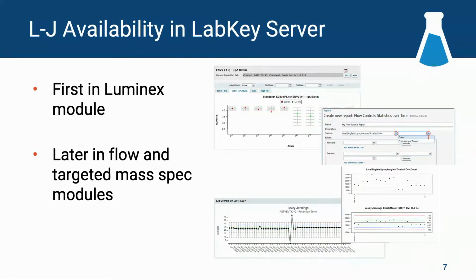We worked with a lab that essentially was adapting a workflow that they had already been following for a long time. They had a lot of historical data where they were monitoring the normal ranges for their controls that were really part of every plate. They had a handful of control wells, and they were monitoring those to make sure they were in the expected range. And again, that allows them to trust that their experimentals or their unknowns are trustworthy.